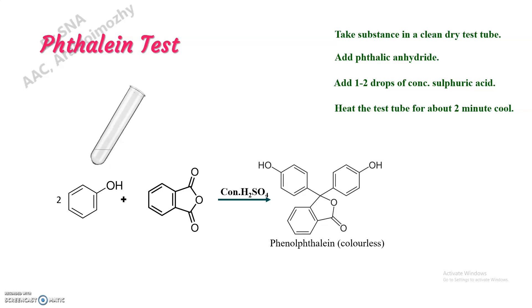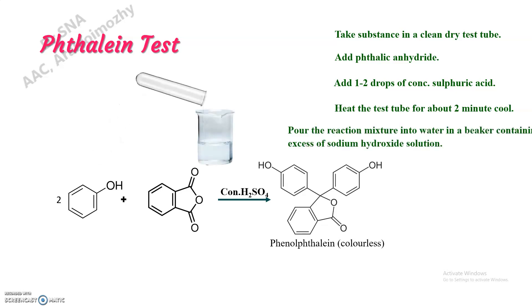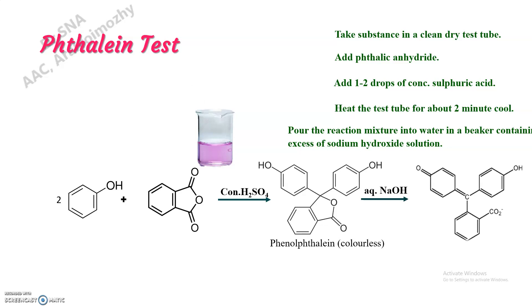We can now pour this reaction mixture into water in a beaker, and to this water we have to add some sodium hydroxide also. Pink coloration is obtained in water because of the formation of the quinonoid structure of phenolphthalein, which exists in alkaline medium. This indicates and confirms the presence of phenol.